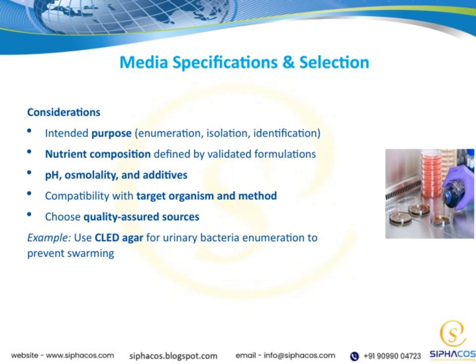Next, ensure that the nutrient composition of the medium is well defined, ideally based on validated formulations. This guarantees consistency and reliability in your results. Another key point is to consider factors like pH, osmolality, and any additives you might include. These can significantly affect microbial growth and viability. Compatibility is also crucial. Make sure your medium works well with the target organism and the method you're using.